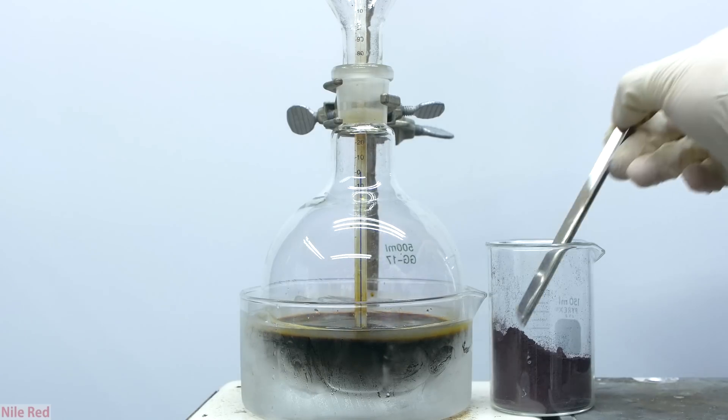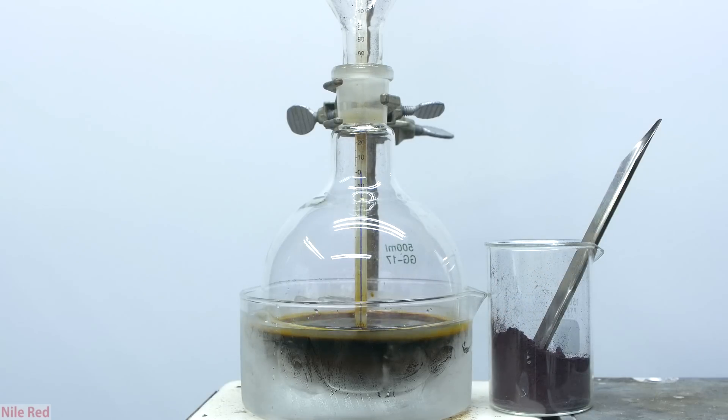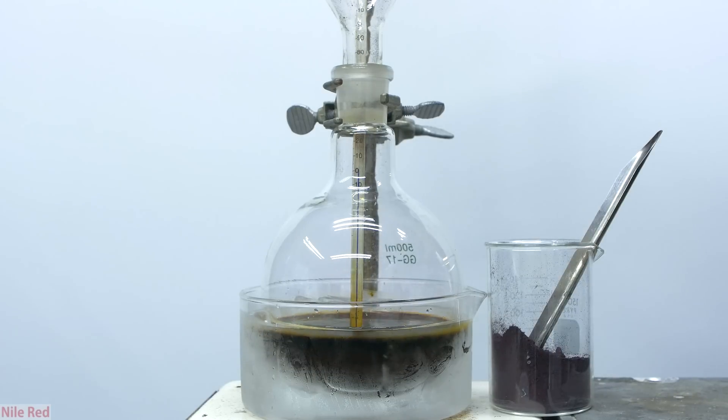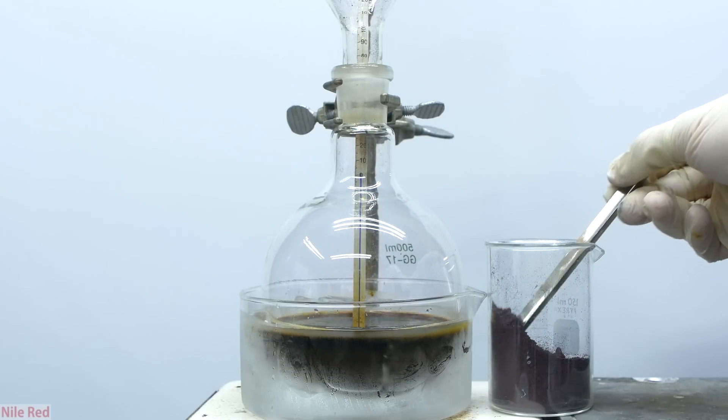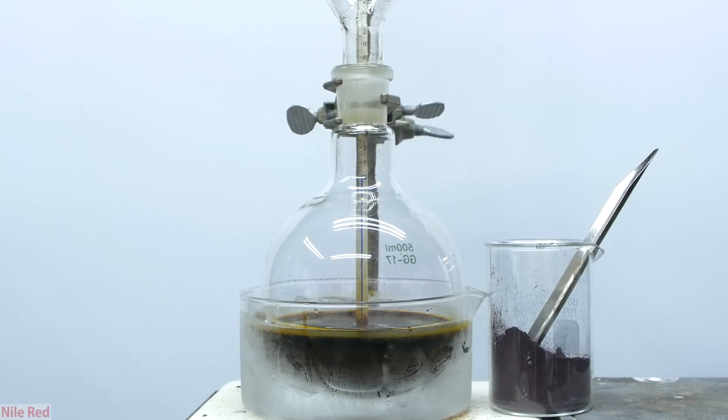The addition of the red phosphorus will initiate the reaction and the production of the methyl iodide, and this reaction is exothermic, which means it releases heat. Methyl iodide has a boiling point of around 42°C, so if we add the red phosphorus too quickly or don't cool it adequately, the temperature could go above 40°C and we can start boiling off the methyl iodide.